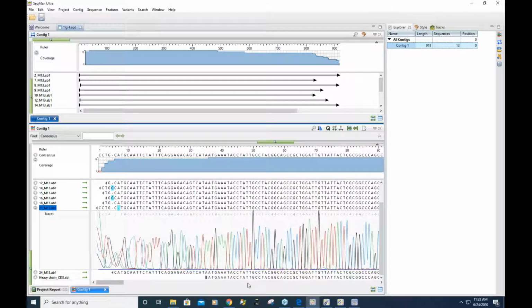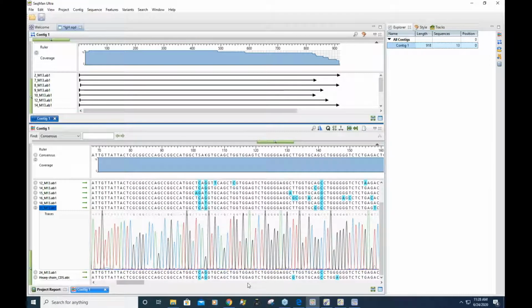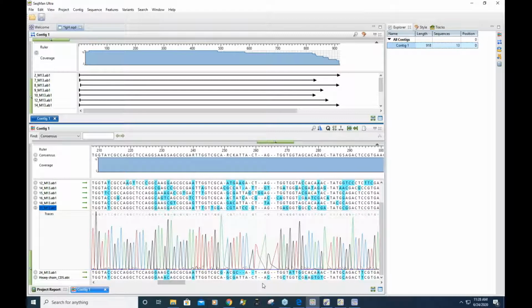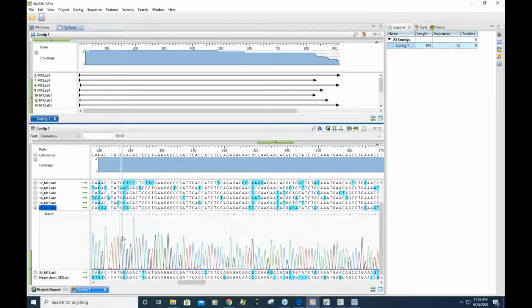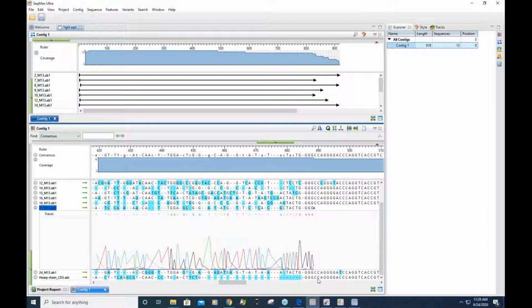You've got really nice strong peaks, very clean, not really seeing an issue. Very strong signal. You just scroll through and you can see the signal started to fade away around position 300 afterward. You can see the signal fading away and it just ends at position, say, 488.